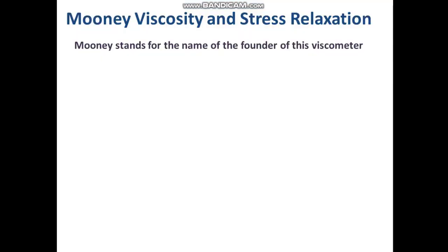Before going to the practical and taking hands-on experience on determining Mooney viscosity and stress relaxation of natural rubber samples, I think discussing some aspects or theories regarding Mooney viscosity and stress relaxation is worthwhile.